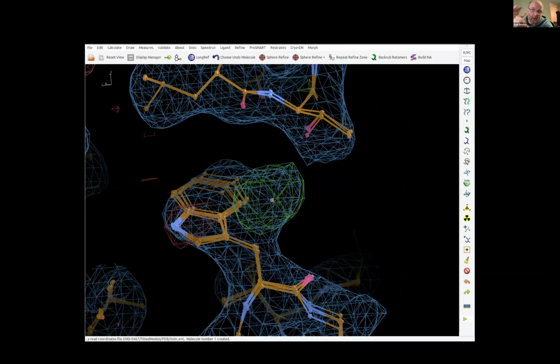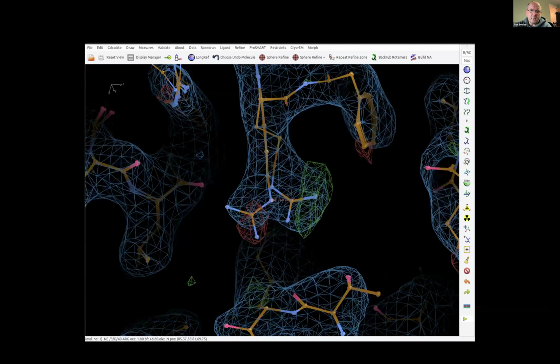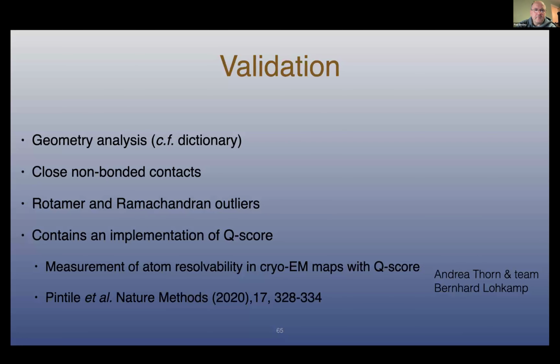So yeah, they've done some molecular dynamics, but they didn't allow enough flexibility of this tryptophan here to find the correct orientation. Had they had this difference map, Fo minus Fc sort of map, for cryo-EM, then they could have straightforwardly identified a rotamer flip, a rotamer flip that the molecular dynamics was not able to perform. It couldn't escape the local minimum. Maybe we could even look at multiple conformations in cryo-EM maps these days, being informed by this difference map.